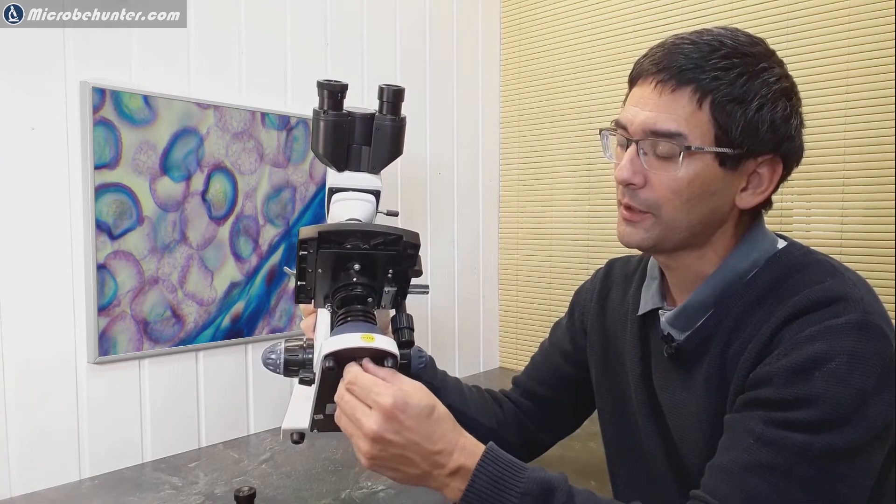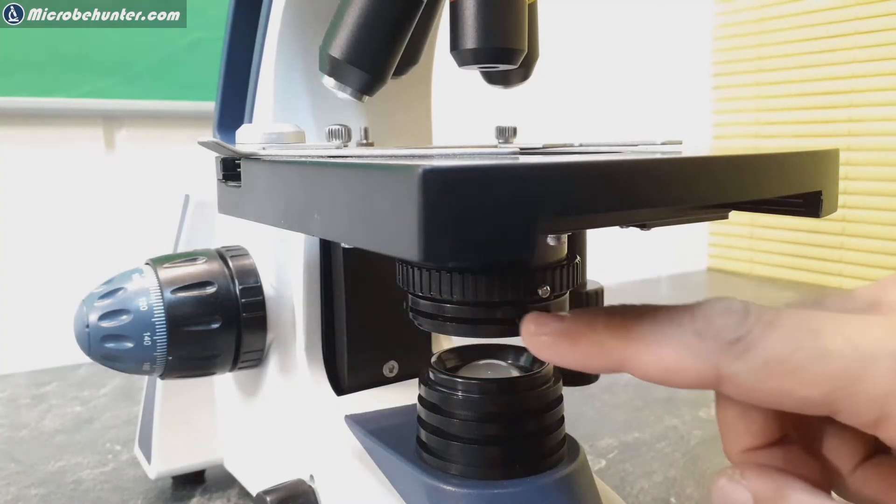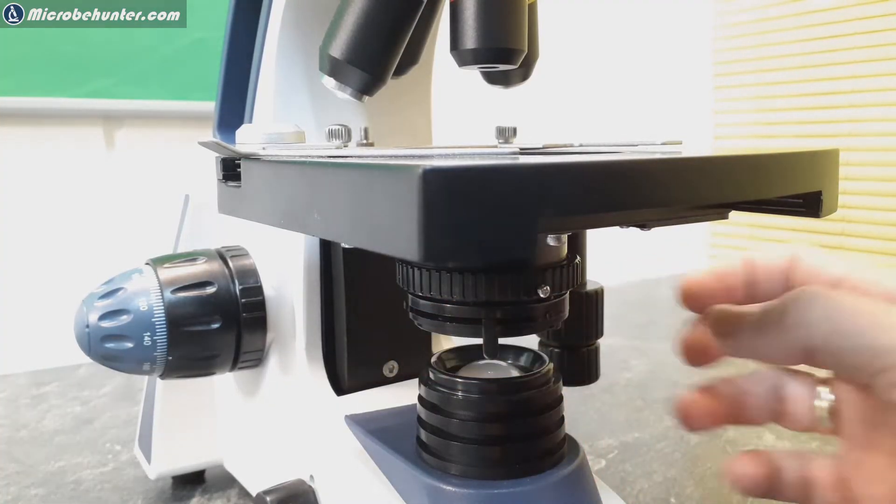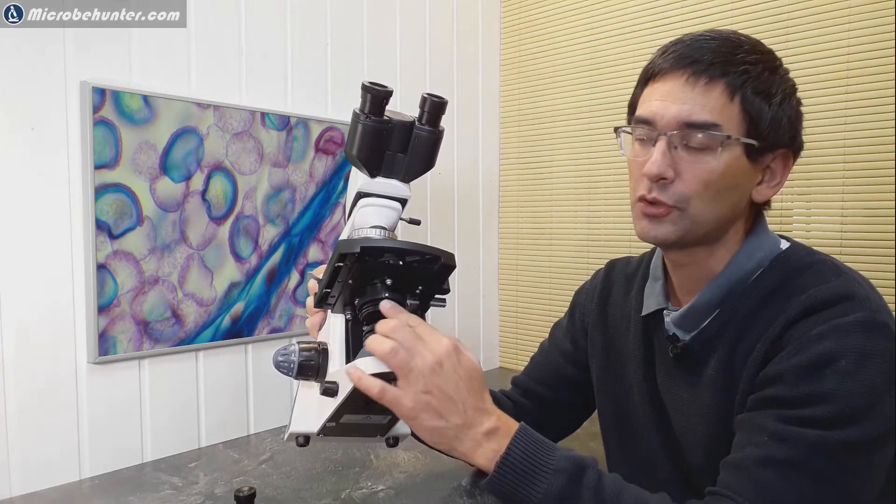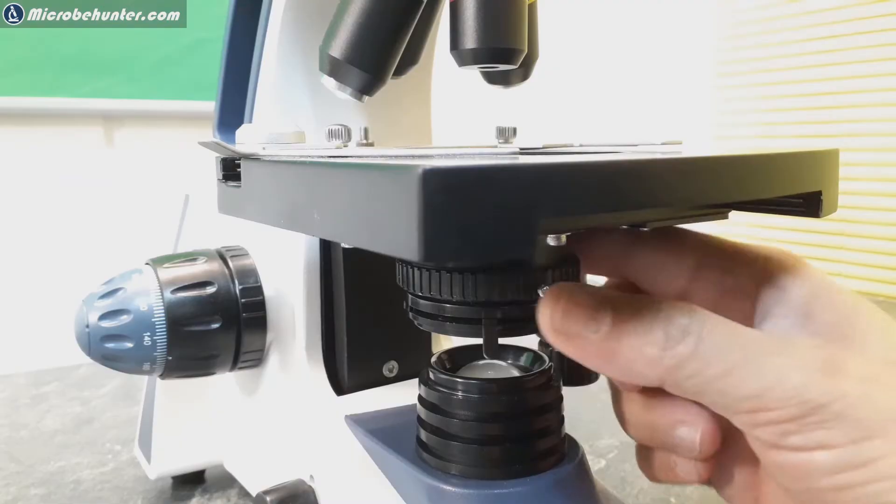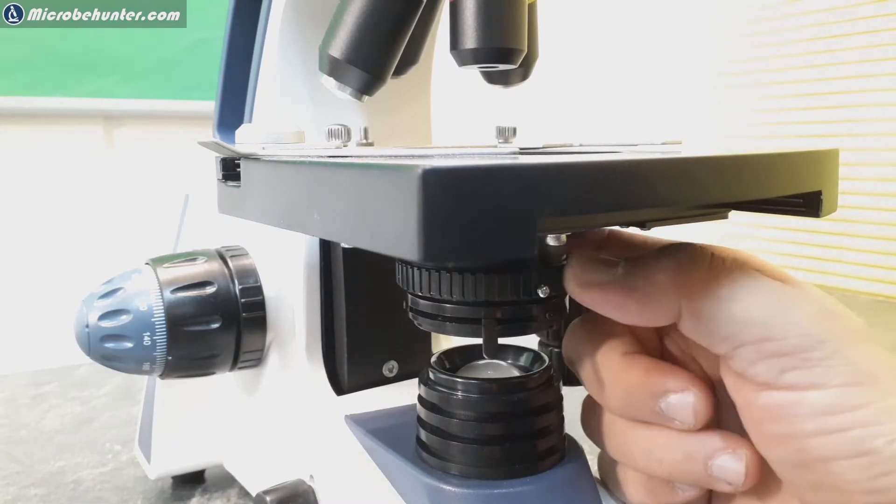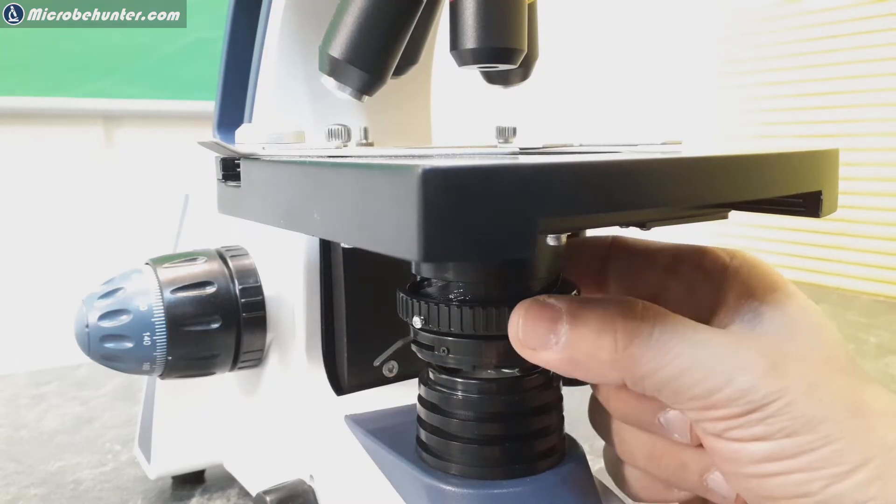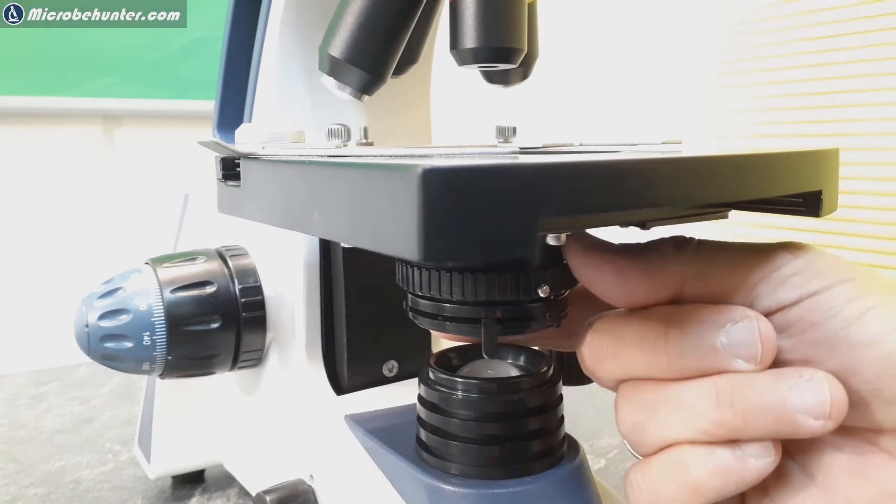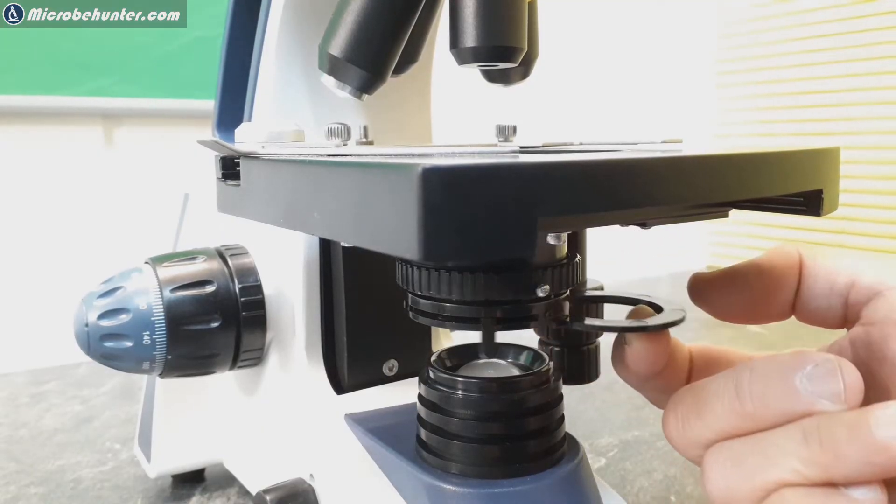We're now going to continue down here. This here is of course the condenser of the microscope. There's the aperture diaphragm here as well. The condenser can be raised and lowered, but not by moving a lever, but by rotating the condenser.